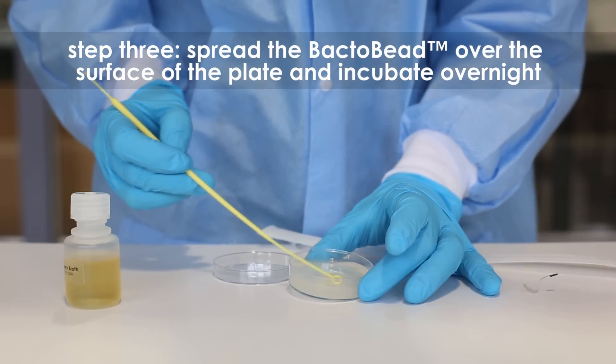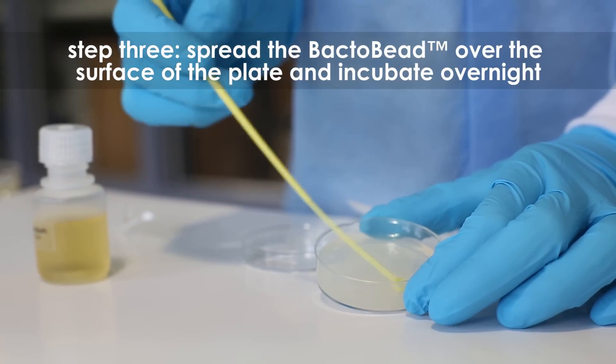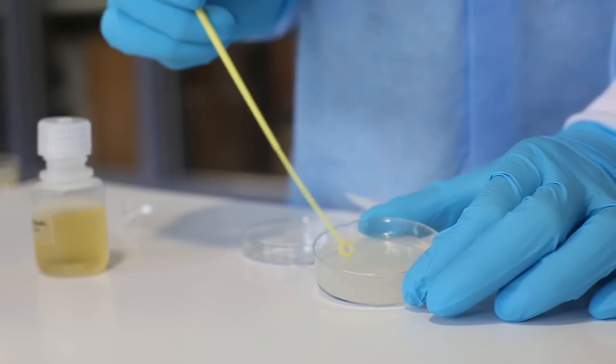Step 3: Spread the Bacto Bead over the surface of the plate using an inoculating loop. Try not to gouge the agar with the loop. Incubate the plates inverted at room temperature overnight.